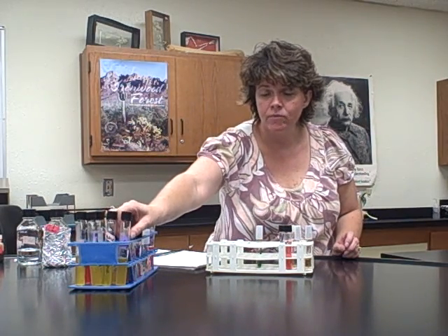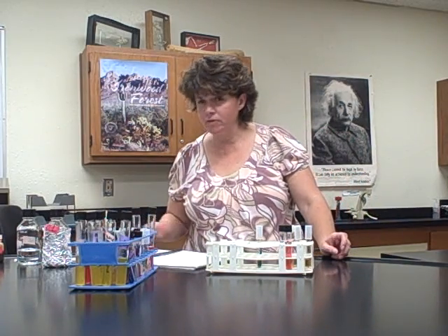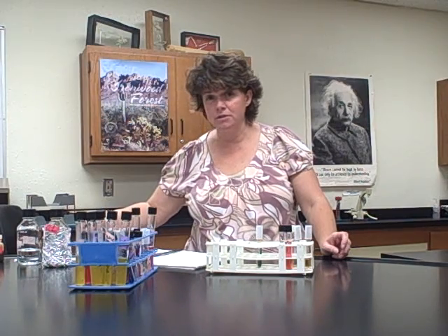And I had told you that I wanted you to do that extra test. So on your table, you could just add an extra column with the bacteria to say if it was citrate positive or negative. Okay? And I just added that on because a previous edition of the book had it on there. And like I said, later in the semester, you're going to be doing a test with citrate. So now you know what it is and it's not something new to you.